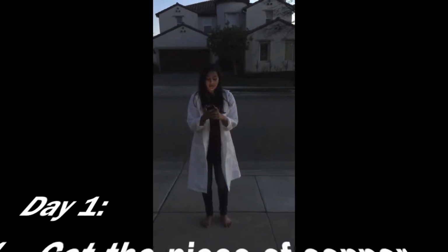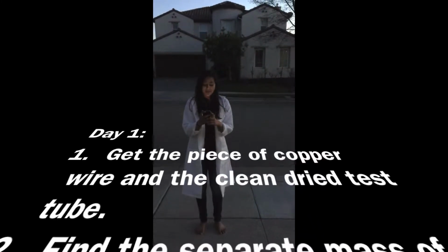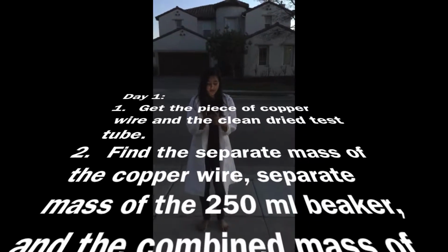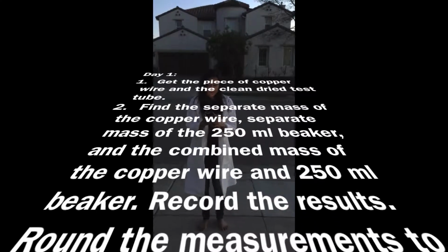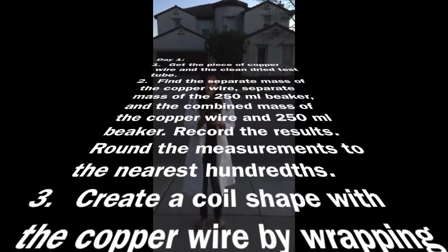This is the procedure. On day 1, step 1. Get the piece of copper wire and the clean dry test tube. Step 2. Find the separate mass of the copper wire, separate mass of the 250 milliliter beaker, and the combined mass of the copper wire and the 250 milliliter beaker. Record your results and round the measurements to the nearest hundredths.